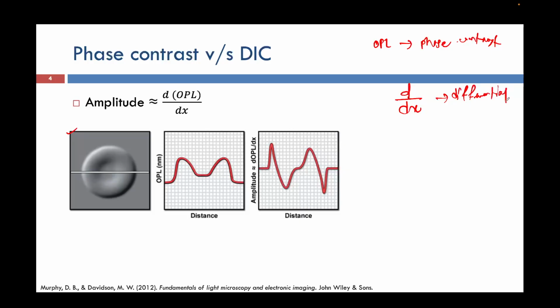Okay, so if you look at this image, we are taking the optical path length traversed from here along this line. This image is the optical path length versus distance diagram. Here you can see the first optical path length, when I am starting from this; just consider this curve, I am starting a little down. So when I am going like this, initially from here to here, my optical path length is not varying that much with respect to the distance.